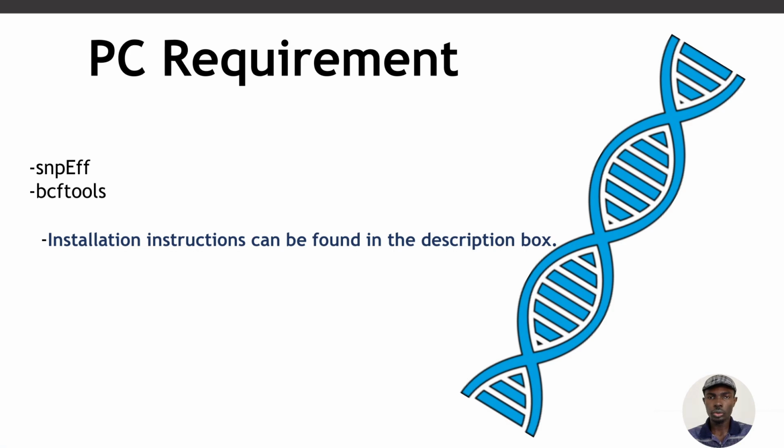For this tutorial, you need to make sure that you have snpEff installed, and you should also have bcftools installed. I have tutorials that show how to set up these tools, so check the description box, you'll find links to those videos. For snpEff, I will show you one approach in this tutorial. So if you're having a challenge, don't worry, I'll show you how to use that approach. What we are going to do next is to open our terminal and then start the exercise.